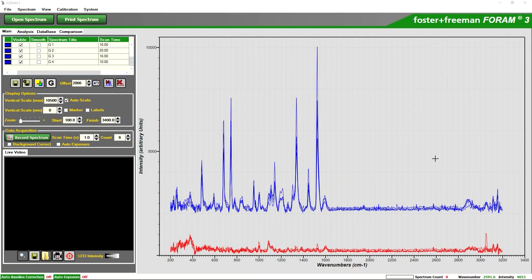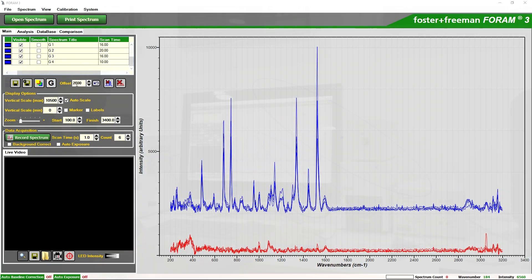To show the statistical analysis I will just select two spectra. Again we can quite visibly see that there is a large difference here and then we will go into the comparison tab and see the results there.